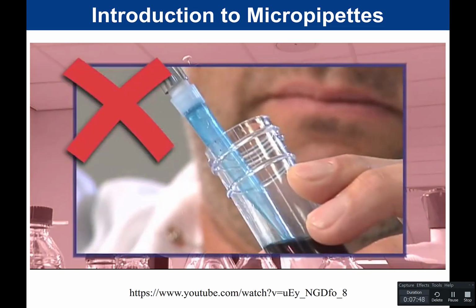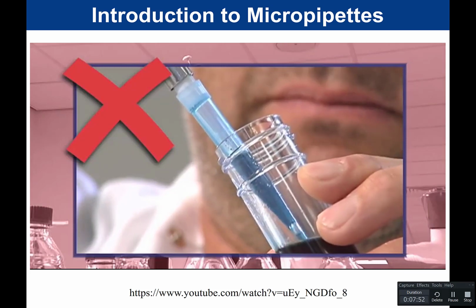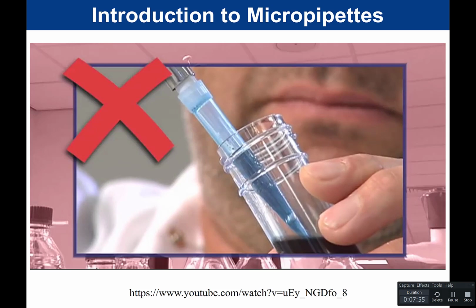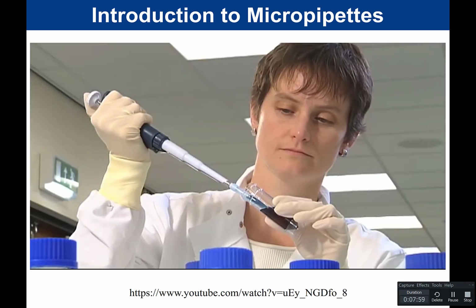The liquid can be sprayed around the inside walls of the tip and up into the pipette body, causing inaccurate volume dispensing and pipette contamination. Make sure you release the push button in a controlled manner.